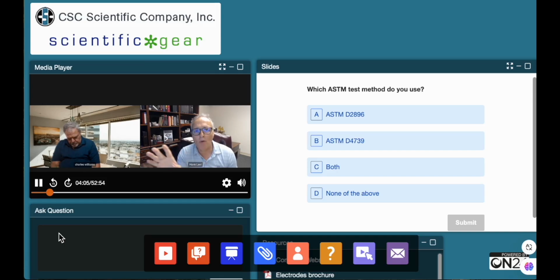10 slides. We're going to go over the TBN base number. We're going to talk about what it is. We're going to talk about what you need to do TBN on a titrator. We're going to talk about some of the things that go into the calculation. We're going to talk about best practices, things to look out for, and just some nice general information.